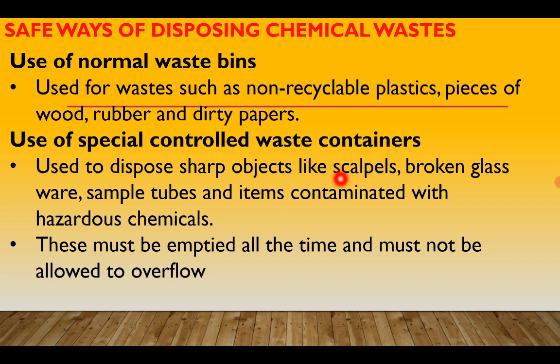If you don't handle scalpels carefully, you can hurt yourself. You can cut yourself. They are very sharp in most cases. So when they are due for disposal, carefully collect them and dispose of them into special controlled waste containers. Broken glassware, sample tubes, and items contaminated with hazardous chemicals can all be collected and disposed of in special controlled waste containers.